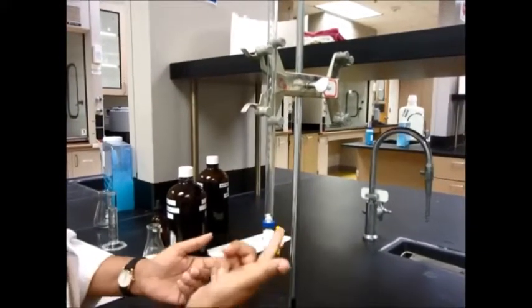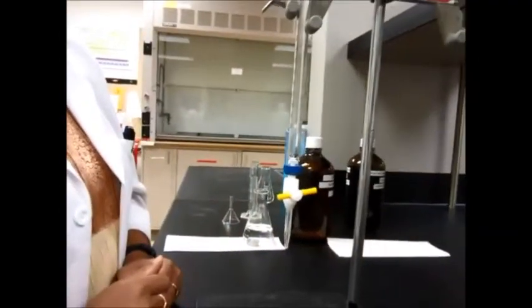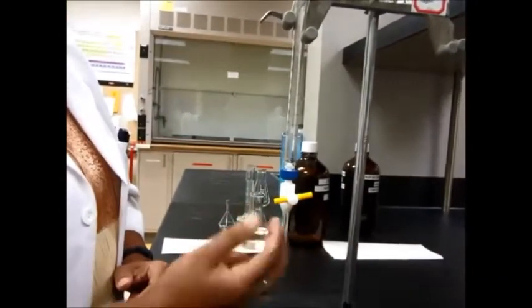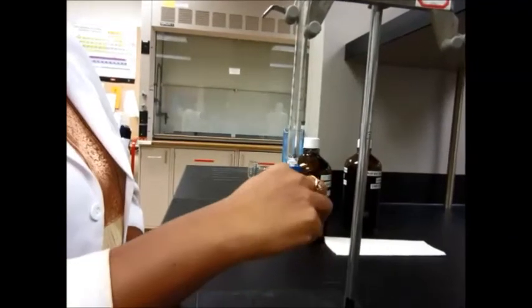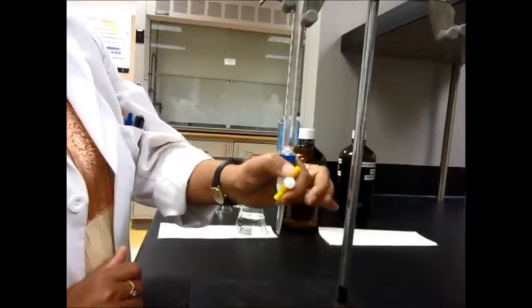So this is open right now for the burette, and this would be closed at this point. So perpendicular is closed, and then parallel is open. You can control the flow by turning this around, as I will show you in a few minutes.